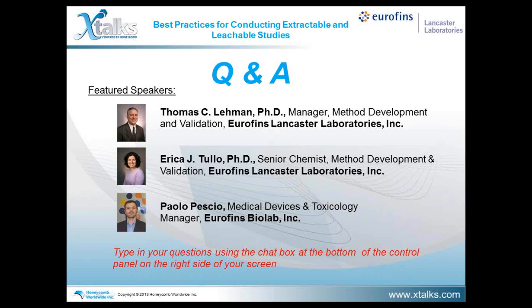Another question, how do you know that surfactants do not extract unique compounds in comparison to organic solvents? Generally, we've done a few experiments showing that they do not extract unique compounds. In addition, we normally run an aqueous solvent just in case water would pull out something that an organic wouldn't. In addition, we still compare the spectra between the control and the sample extract to ensure that no other peaks do come up in the spectra.